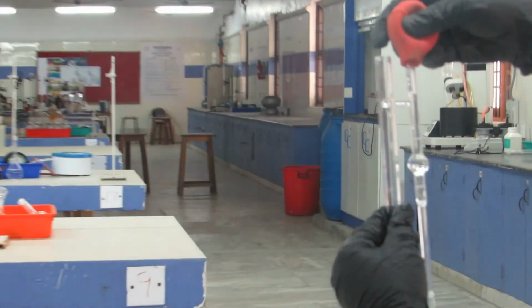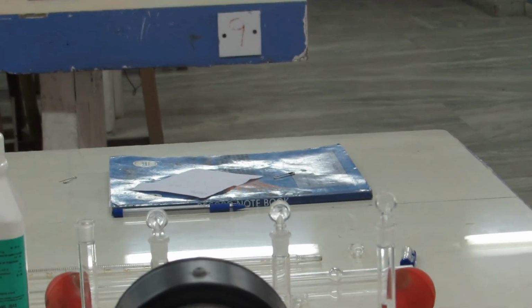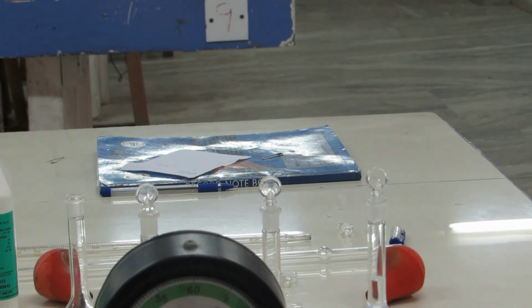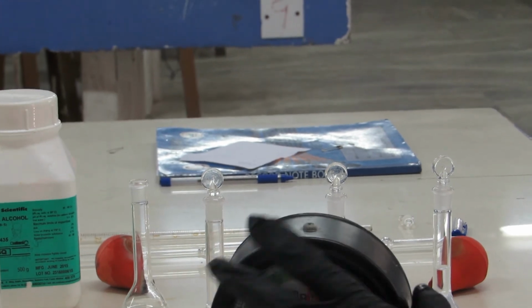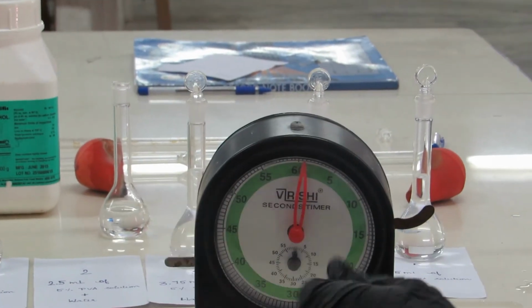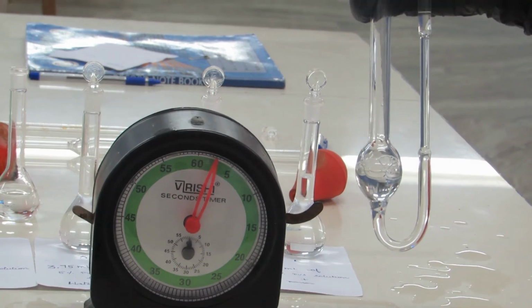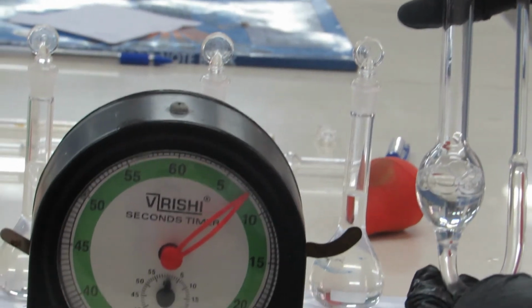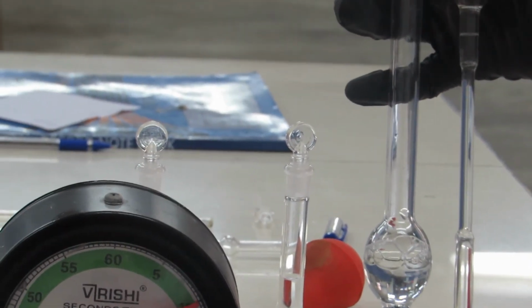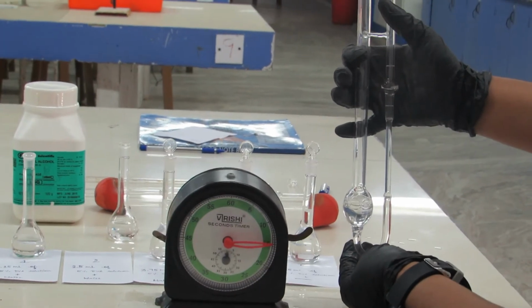Yes. Once you are ready with the stopwatch and the PVA solution, yes, we have to start both at a time, and we have started already. Now we are going to measure the flow time for the third concentration, that is 0.5% polyvinyl alcohol. In a similar manner, we will be doing it for three more concentrations of polyvinyl alcohol. Okay. Now we have to stop exactly.